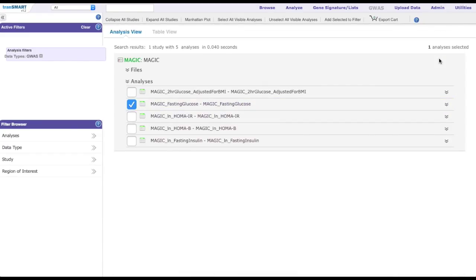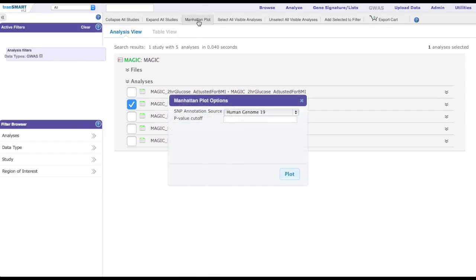To view a Manhattan plot, select analyses of interest, for example the MAGIC fasting glucose, and click the Manhattan plot link at the top submenu of the page. A modal window will appear for the user to determine a p-value cutoff, for example 0.05.